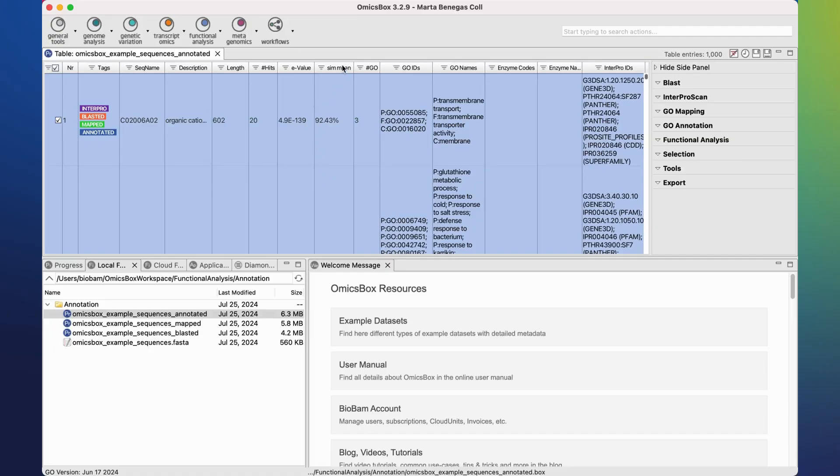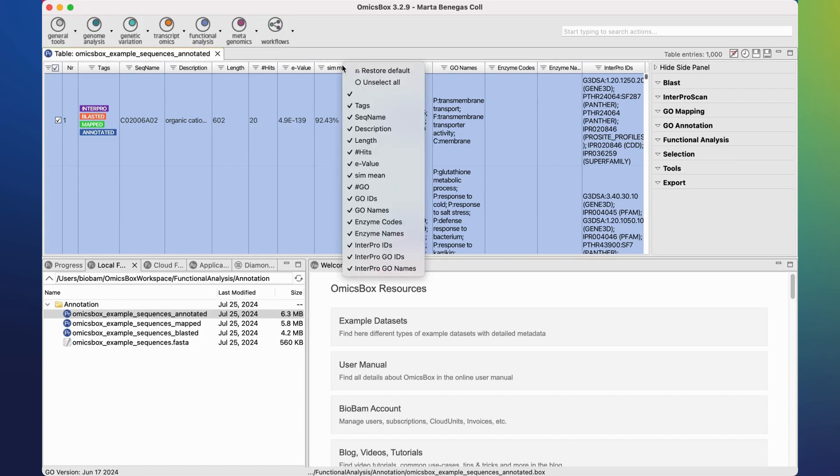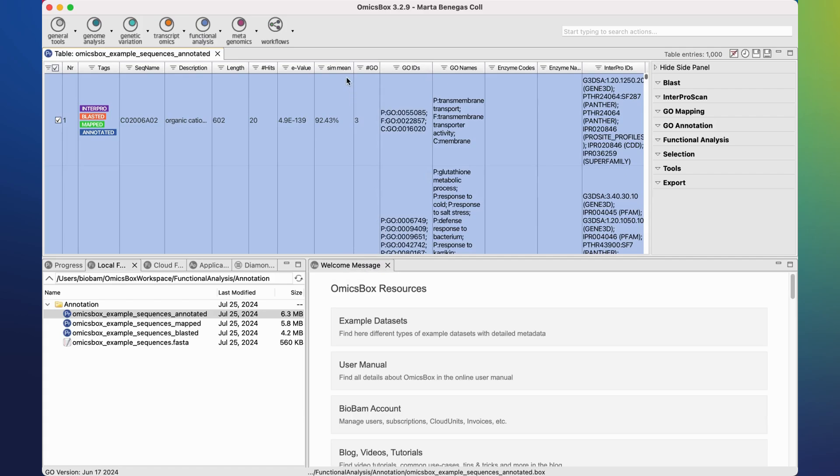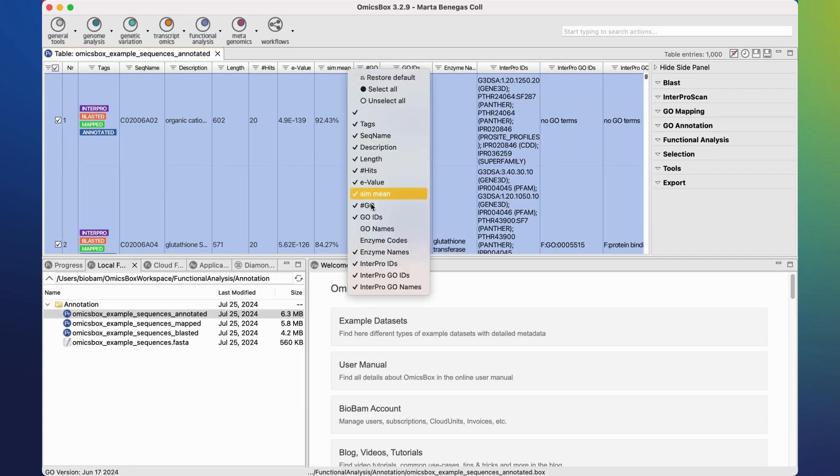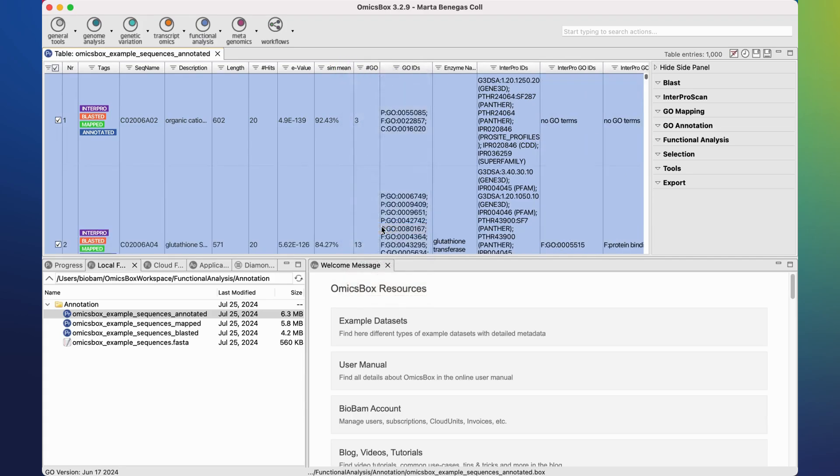If we right-click in any of the column headers, we can select which columns we want to hide or show again.